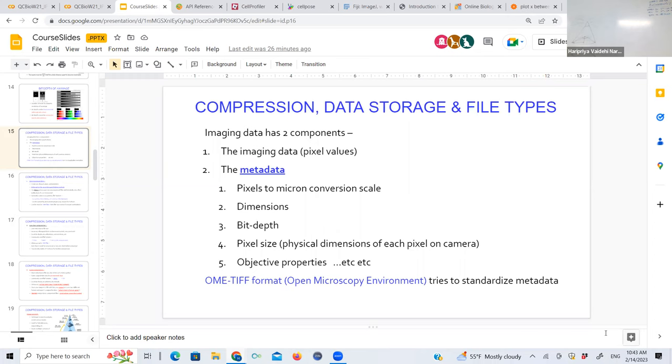So that describes, like I mentioned, what is the pixel to micron conversion scale of your detector? For example, my hardware configuration on my scope is set up such that with my particular 20x objective, and my particular camera model with the connections that they have given a certain distance, it produces 0.65 microns per pixel on my detector. Now, if I change the distance by putting a tube lens inside, that's going to change because if I move my detector, it's going to be bigger and I'm going to get crappier resolution. If I move my camera closer, I might get something better. So that's something decided by your hardware configuration. And you should know that to measure physical distances on your image. If you want to measure the actual size of a cell in microns, you can only measure it in pixels on your image, and then you need that scale to convert.